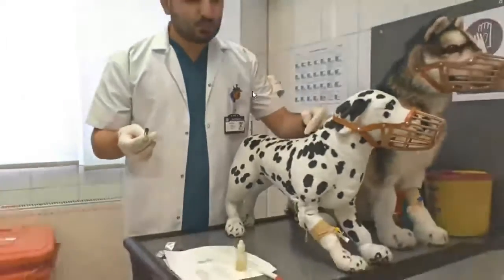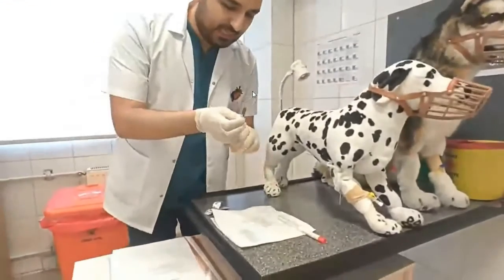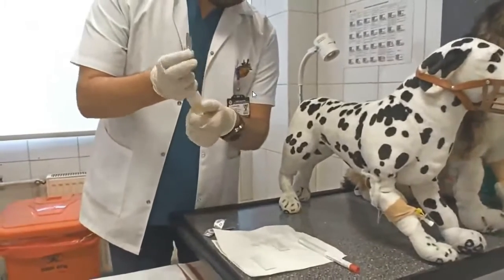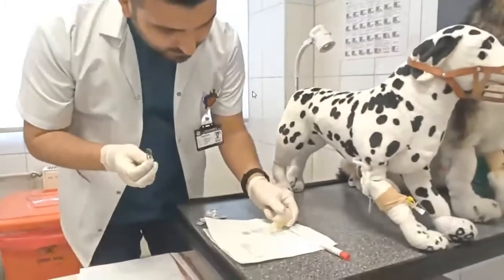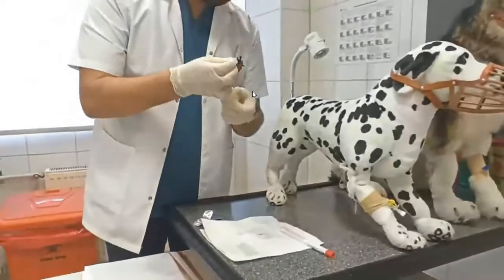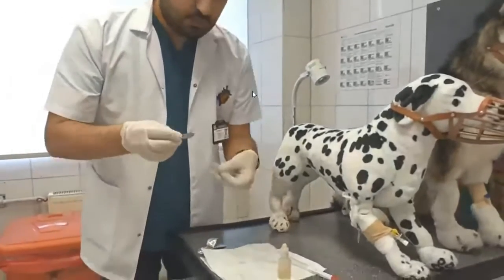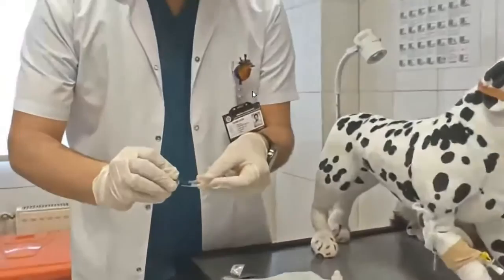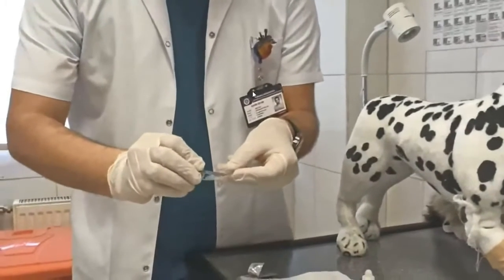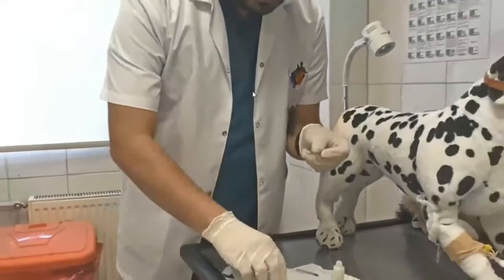After getting the sample, it's possible to compress the antiseptic solution in that area. Now I drop a drop of glycerin on the slide you are seeing, and then mix it with the sample like this, slowly.